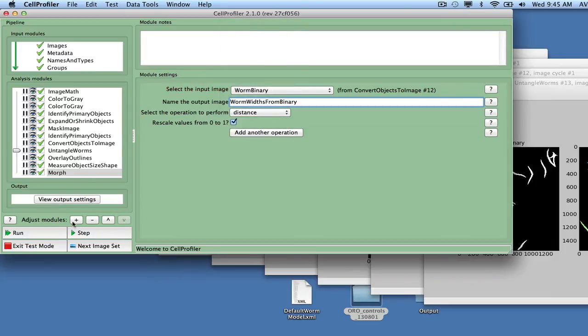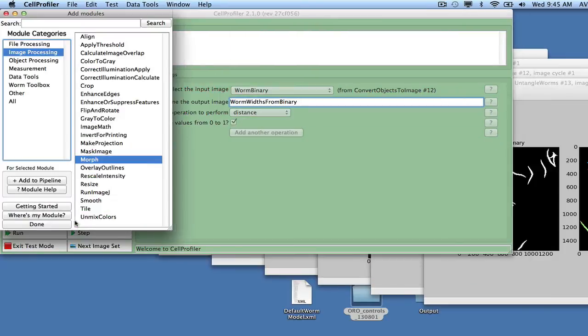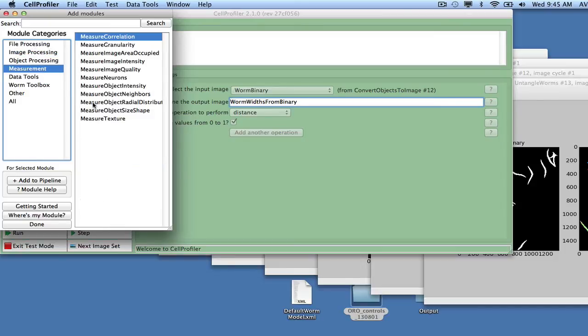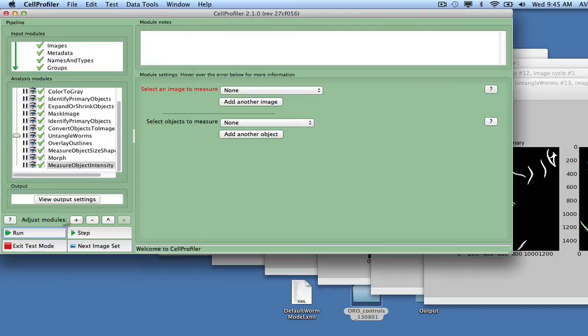Add the Measure Object Intensity module to measure worm intensities. Select Ridge Red, Ridge Blue, and Worm Widths from Binary as the images to measure.